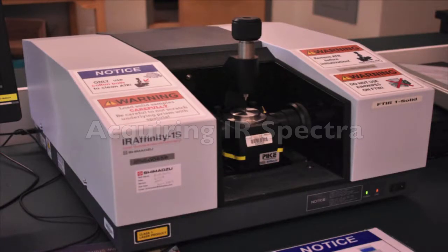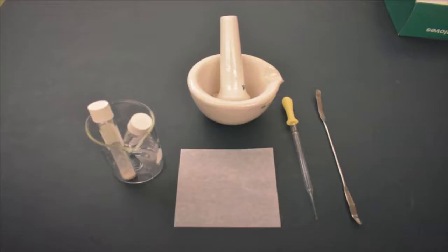Now we'll move on to the IR machine. Here are the items you'll need: your liquid and solid sample, a spatula, a Pasteur pipette, mortar and pestle, and weighing papers.